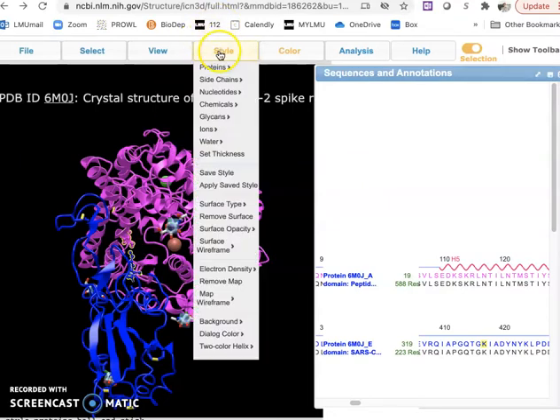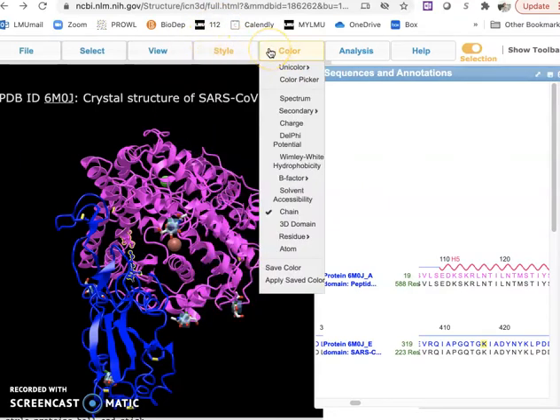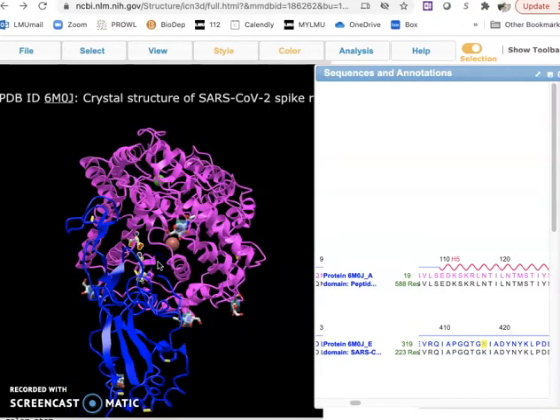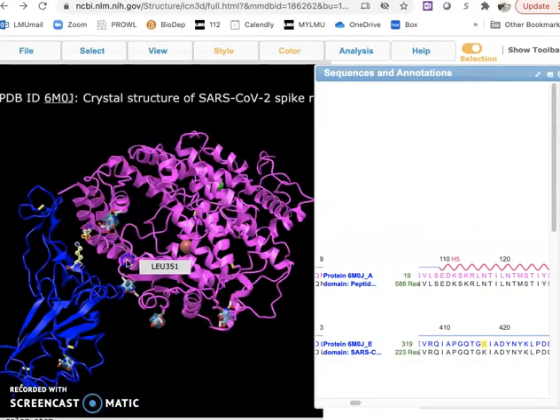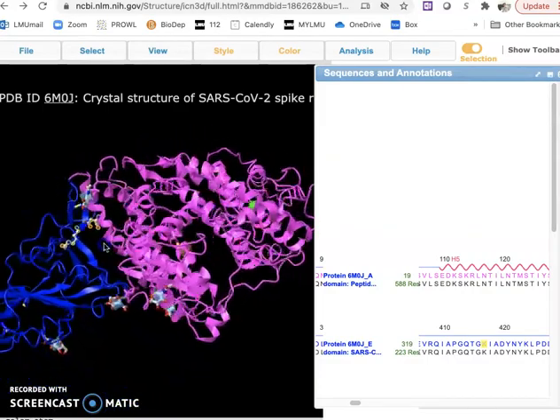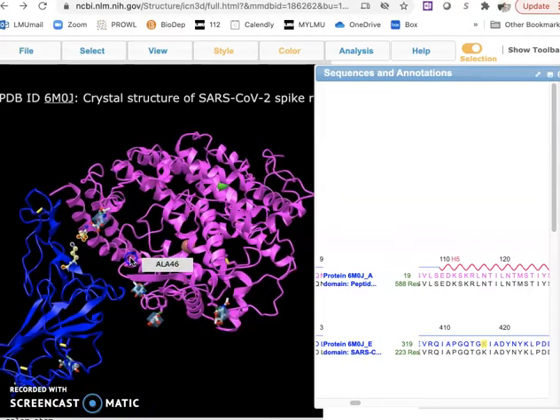I do want to turn on the color atom so my atoms are visible here. So you could see, another interesting thing you could do here, if you feel like a lot of stuff is in your way.